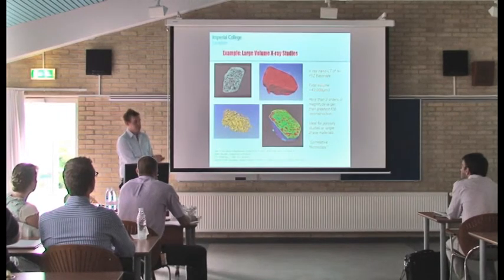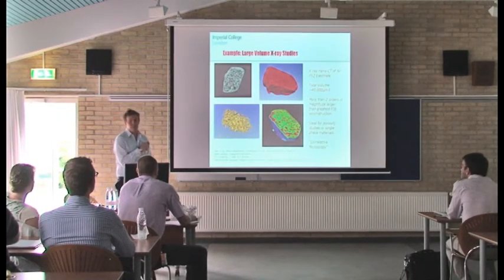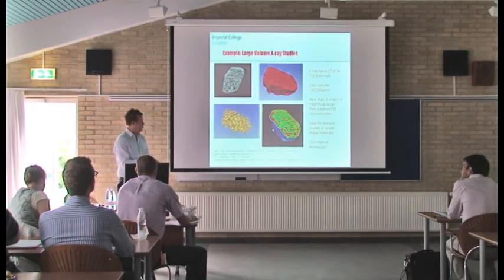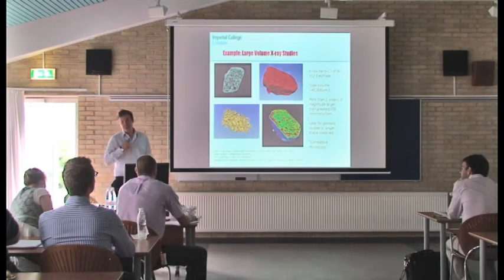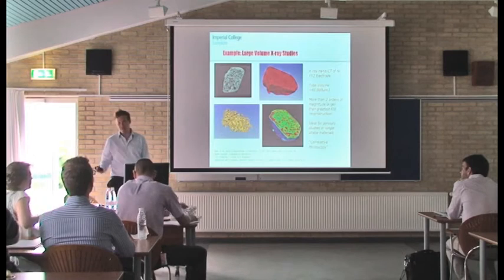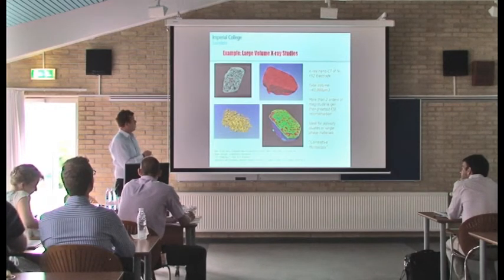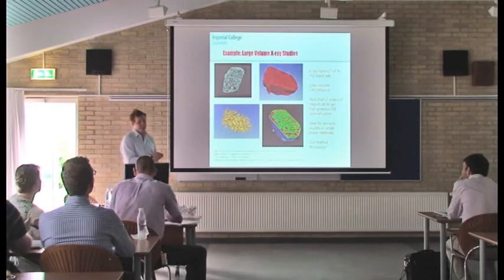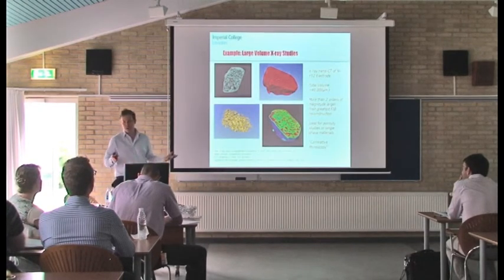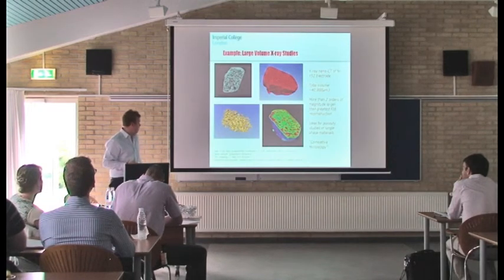It's about 40,000 cubic microns, which from the literature at the time when I wrote this, was more than 2 orders of magnitude larger than the greatest FIB reconstruction that we'd seen reported. So if you're just looking at porosity or perhaps single-phase materials, there are certainly advantages of using the lab-based nano-CT system, because you can characterize pretty large volumes with pretty decent resolution.